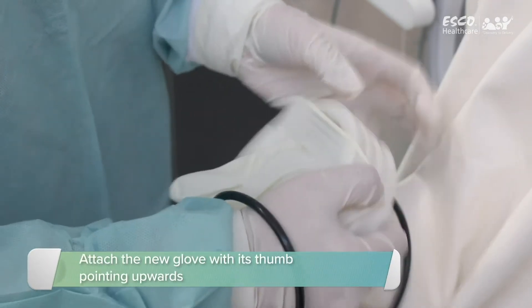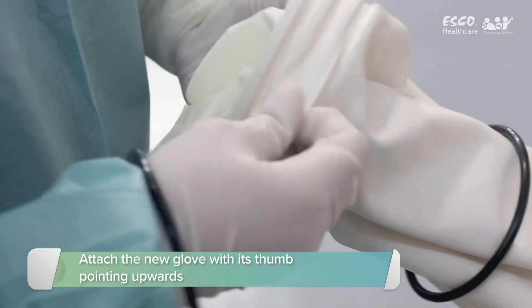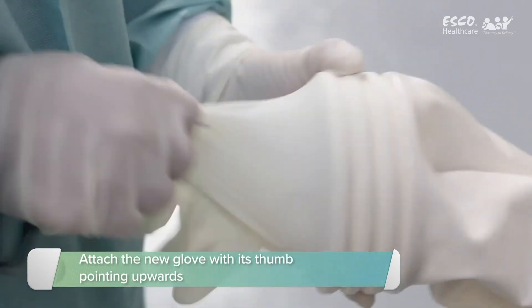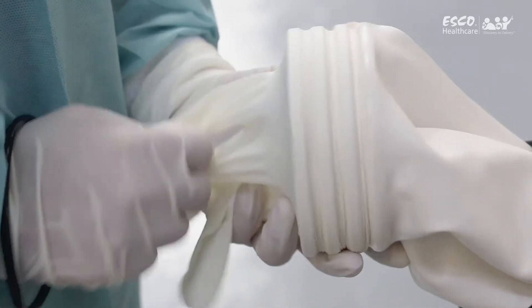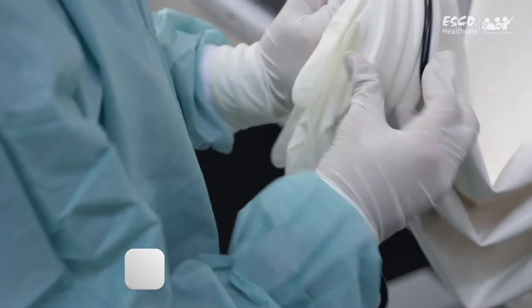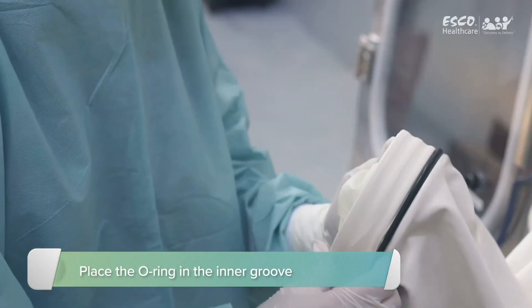Take the new glove and attach it to the cuff ring, ensuring that the thumb is at the top. Stretch the ring of the new glove over the port and over the old glove onto the middle groove. Install the ring up to the inner groove.